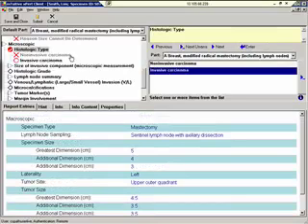Now that I've made my selection, you can see that non-invasive is turned off. The system will never ask you questions that are not applicable. It will also not include these questions in the final report, which is important for clinicians reading the report.